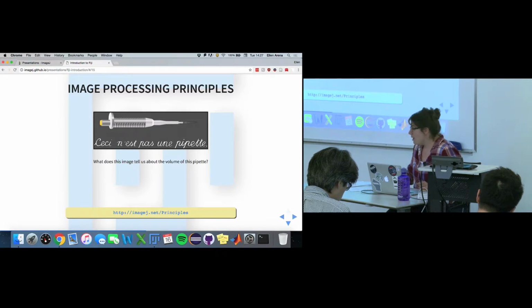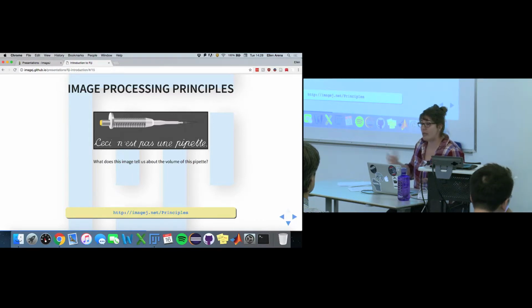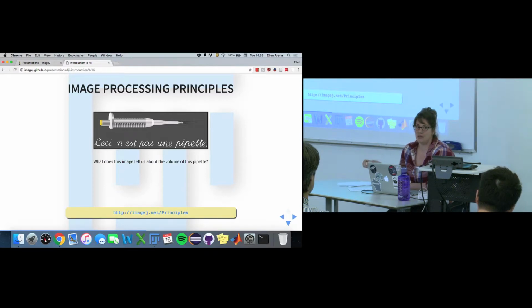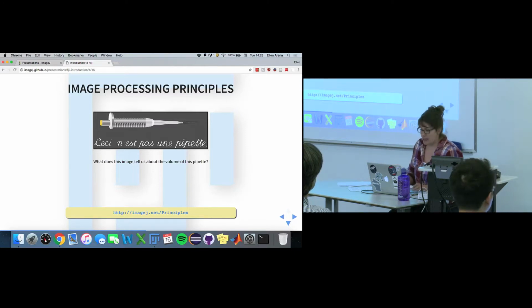When you are acquiring your data sets, that's what you have to keep in mind. At the end of the day, after all of the preparation you put in designing experiments, carrying out experiments, your biological samples, preparing them, staining them, prepping them, imaging them, choosing the right imaging modality to use, acquiring it in a good way, sampling your data correctly, all you have are those sets of images that you acquired. That's it, right? So this is the data that you have to work with. So your job is really, of course, to take great care in all of those steps leading up to that, but then also do everything you can to save the best data possible.